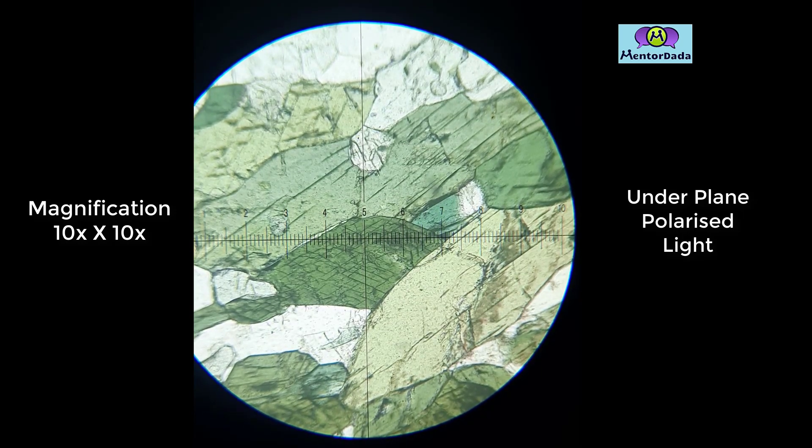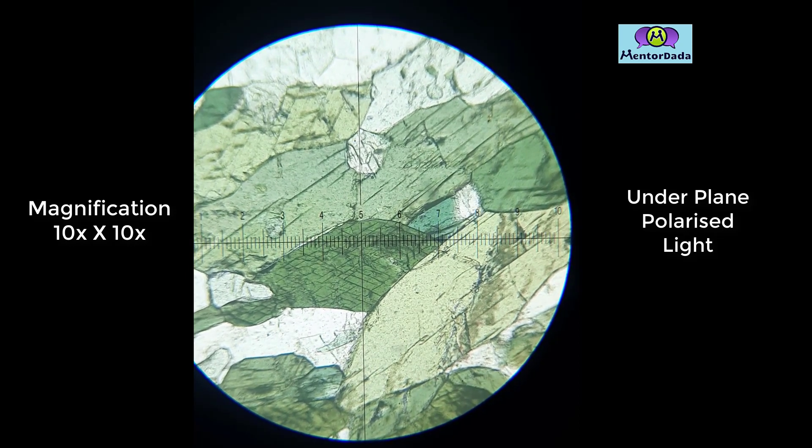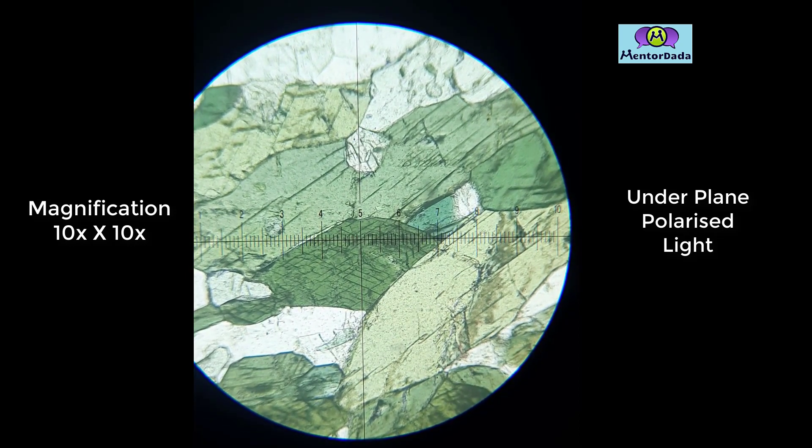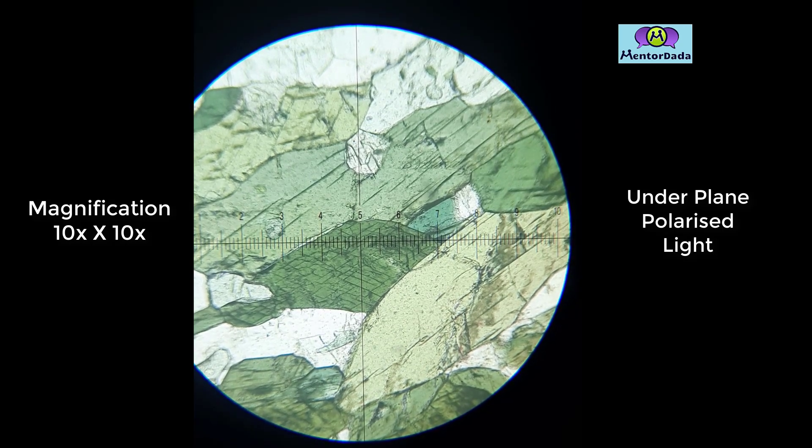This position is inclined. This position infers that the mineral is showing incline extinction.